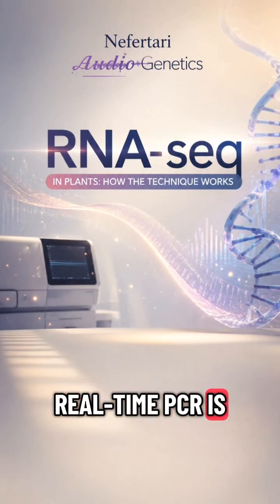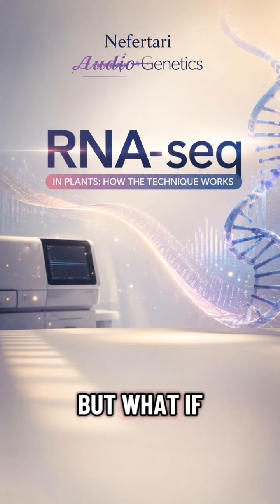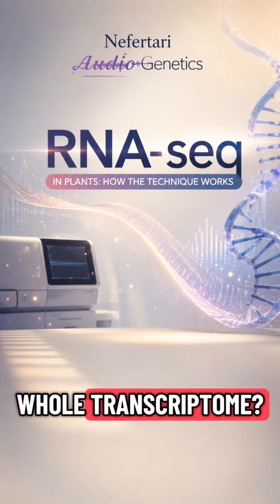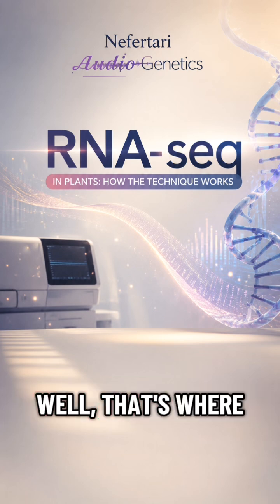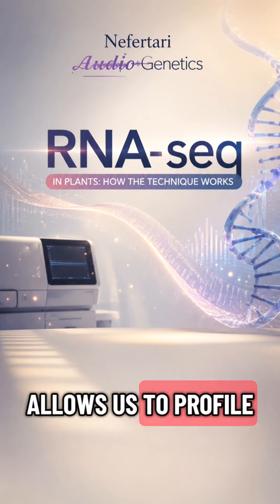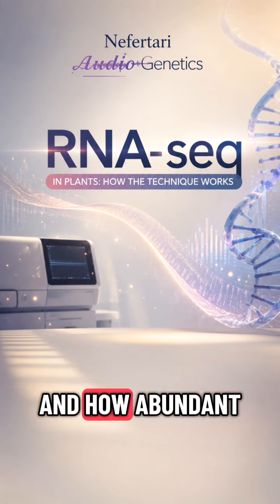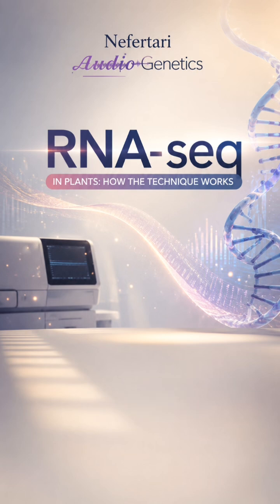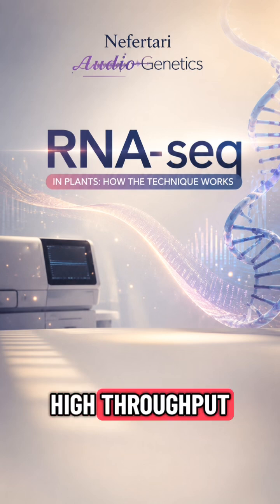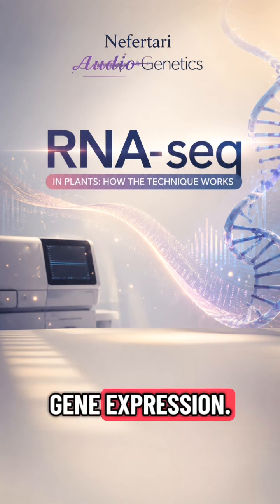Real-time PCR is a targeted method that measures a few selected genes. But what if we want to look at the whole transcriptome? Well, that's where RNA-seq comes in. A technique that allows us to profile the entire transcriptome and see which transcripts are present and how abundant they are. RNA-seq is a high-throughput sequencing technique that provides a genome-wide view of gene expression.